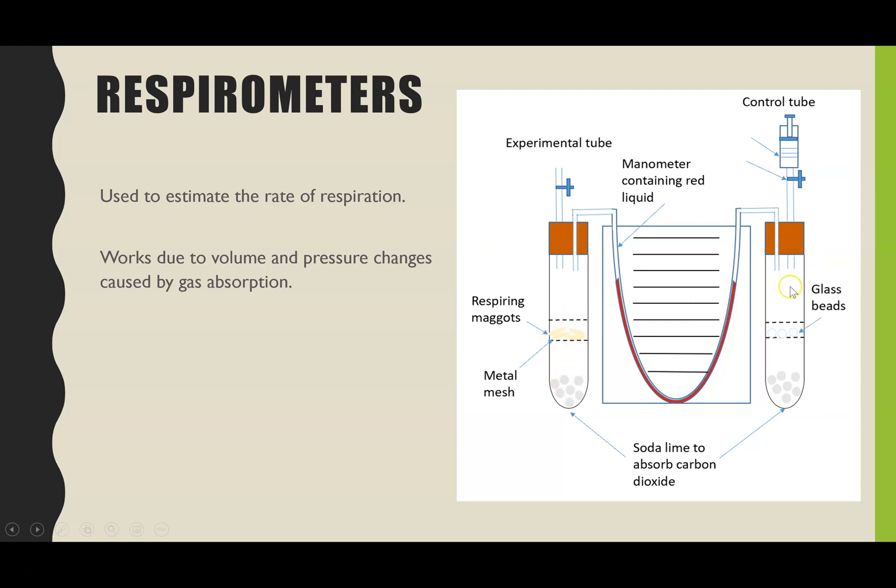Our control tube exactly the same except if we want to prove that it's definitely the organism that is respiring and nothing else causing the changes then we need to put an inert object so we've got glass beads here as an example because they won't be respiring but you'd put the same mass of glass beads in as maggots just to keep everything consistent.